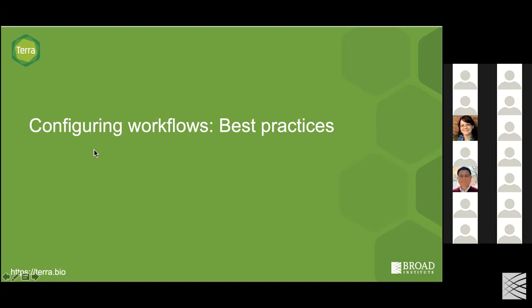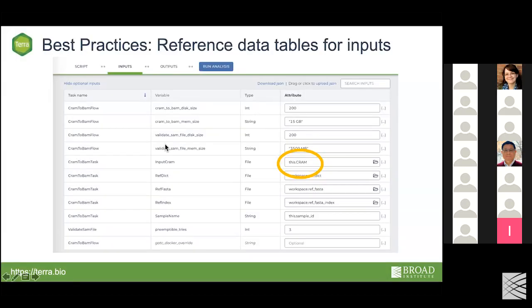All right, so configuring workflows, best practices. All right, so we have three main best practices that I wanted to mention as you're getting started running data in Terra. And the first best practice is, when possible, reference your data table for your inputs to your workflow. And there are a couple of reasons for this.